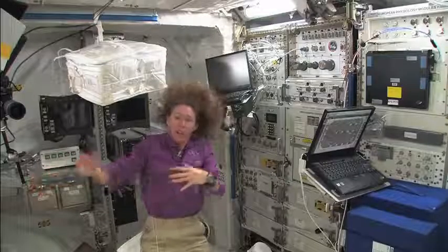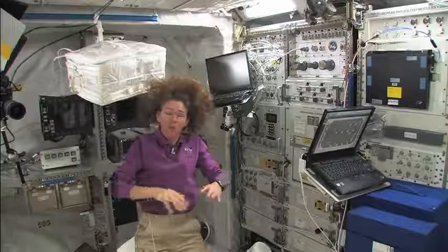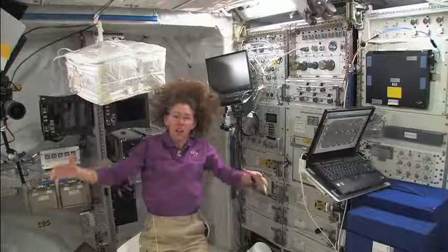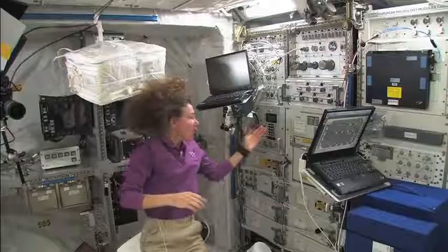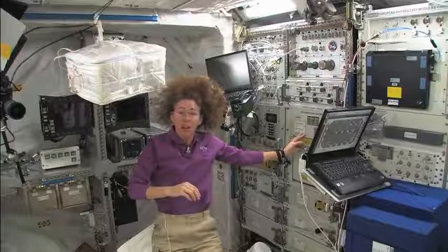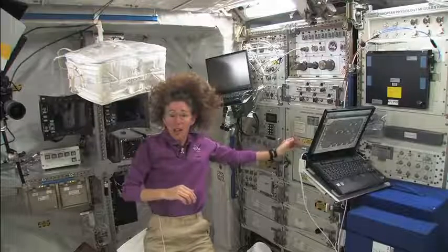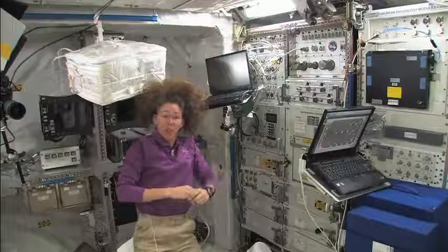We go from 1 to 6 orders of magnitude less, and then we're going to try and live in these environments that are somewhere in between. So this is a very good data point for trying to understand the magnitude of the possible changes that we can see in the human body. In this rack, there's a refrigerated centrifuge, and the purpose of this centrifuge, unlike the one in the Japanese segment, is strictly to process blood and urine specimens and get them ready to go into that freezer for conservation before returning to the ground.